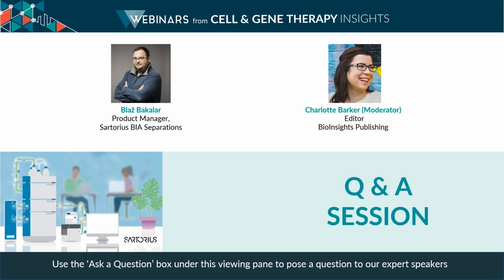Another question here. Is there any impurity, say dsmRNA, observed during the fed batch mRNA? We covered that a bit already, but if you don't mind. Yeah, I think. So we have an analytical method that is able to detect this double-stranded RNA, which we've confirmed with the J2 antibody as well, which is the standard in the industry right now. But I think I already answered, sorry, that the continuous fed batch, continuous feeding didn't increase the double-stranded content.